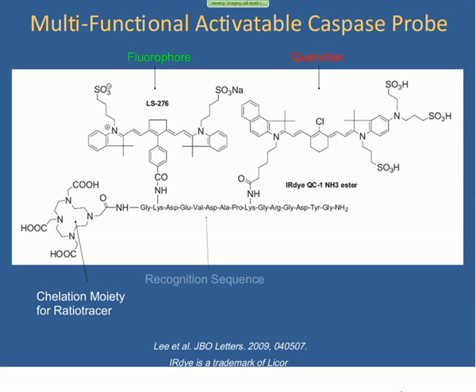Now, they've gone on to use this TCAP probe in a number of different models, and perhaps this is one of the advantages of using fluorescence: it's amenable to other fluorescence techniques, for example, microscopy or flow cytometry. Here they've used their fluorescent probe in a model of glaucoma, where they're injecting NMDA into the retina, inducing cell damage.